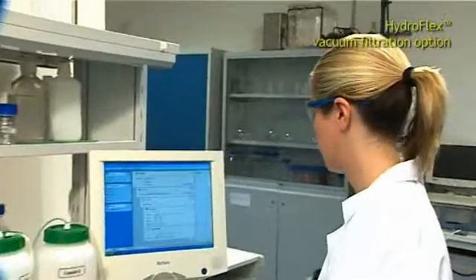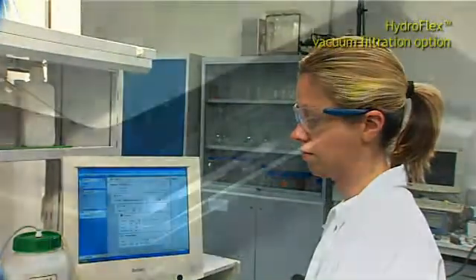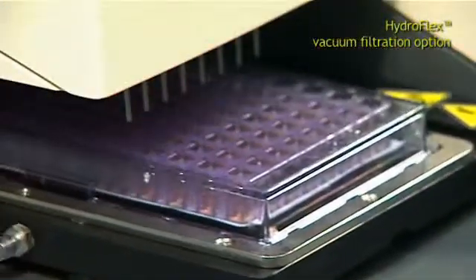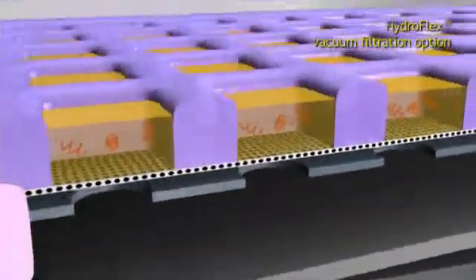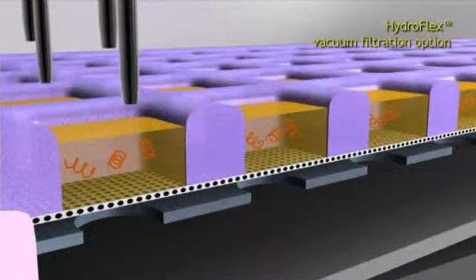The vacuum status is monitored online and only has to be prepared once. Protocols for PCR cleanup as well as bead separation are started automatically.